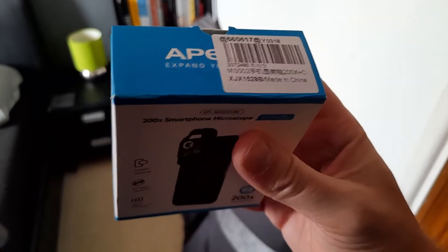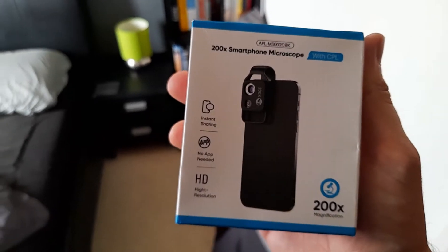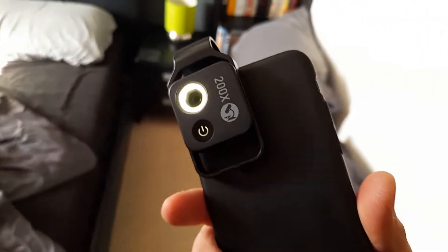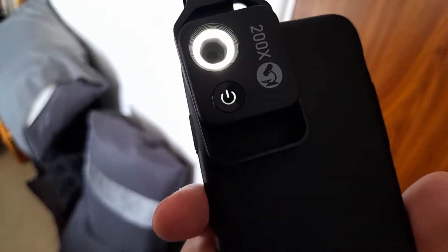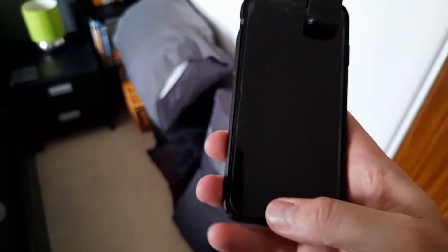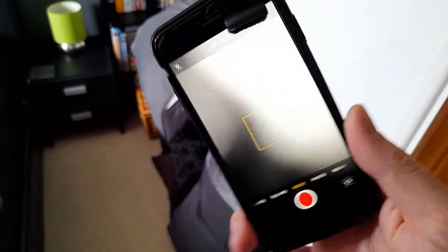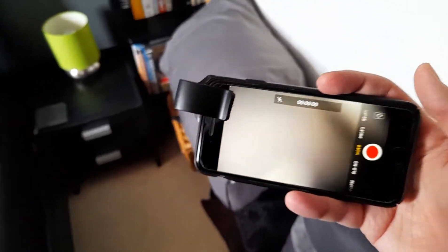I got this for another project, so I'll show you that video in the future, but I just wanted to do a quick video on this. This is my other phone — I've attached it to it. You charge it up via USB, then you turn it on and it's got a light. Then all you do is go to the camera function and then you need to put it onto an item.